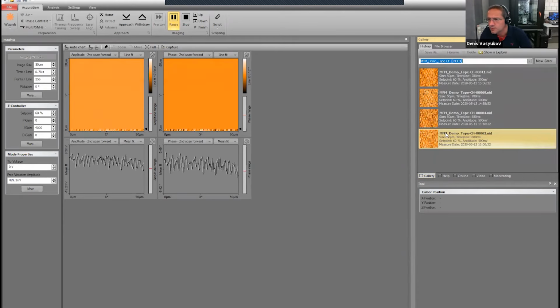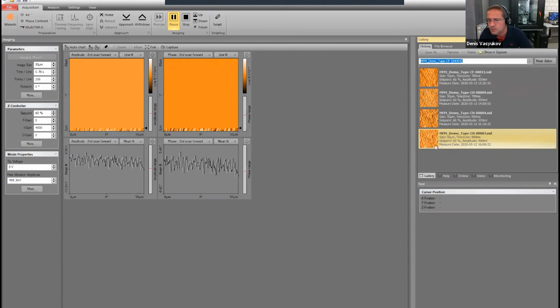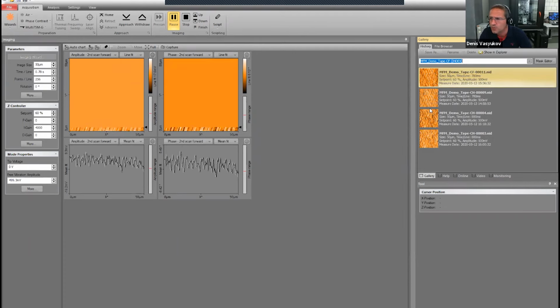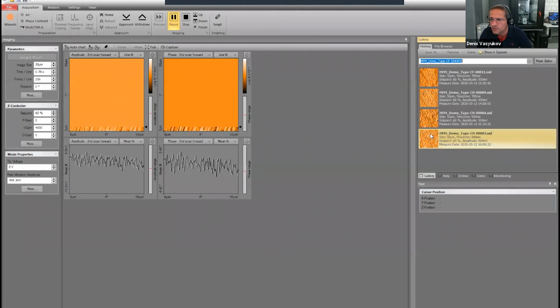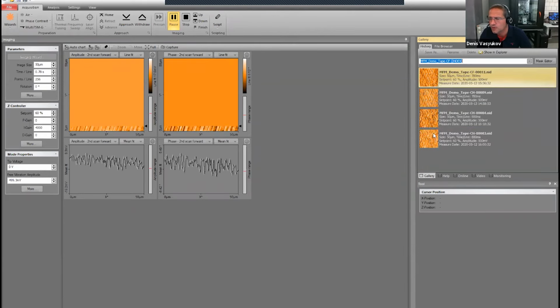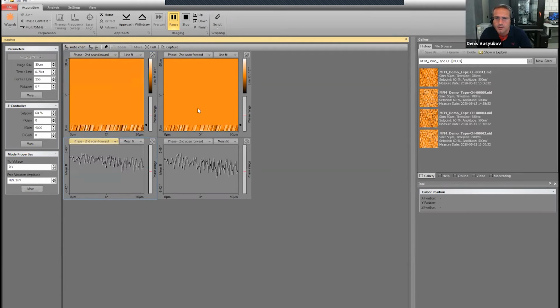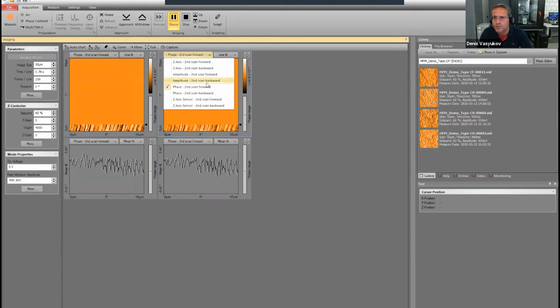Now I did some measurement here beforehand, and so you see these are all nice magnetic images of this tape. One thing to know, if you would like to have a magnetic phase channel as the icon in this gallery, you have to move it to the left. You have to make it the leftmost tile. So second phase, and put amplitude here.